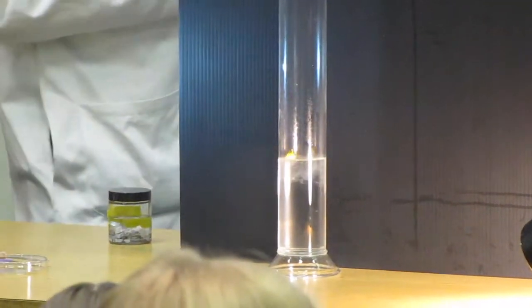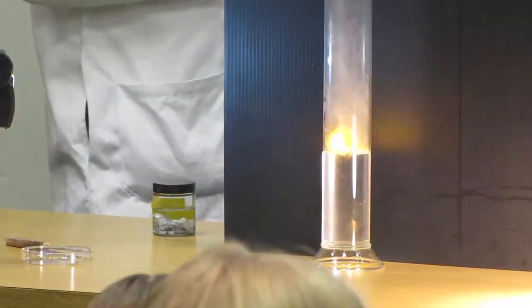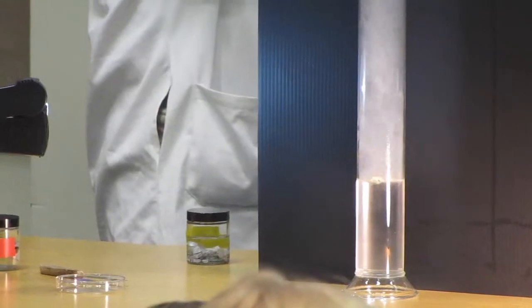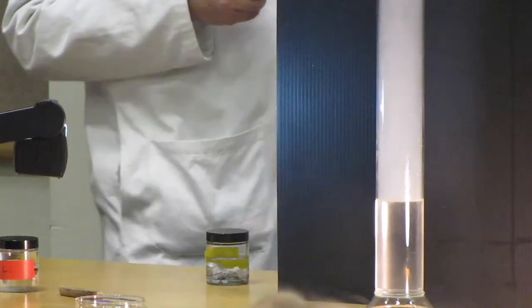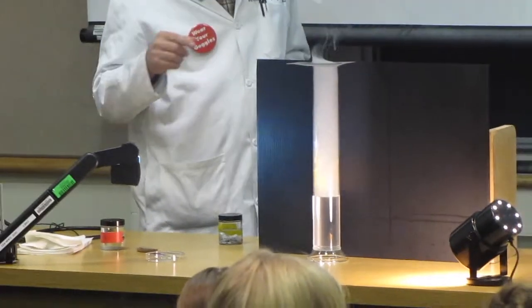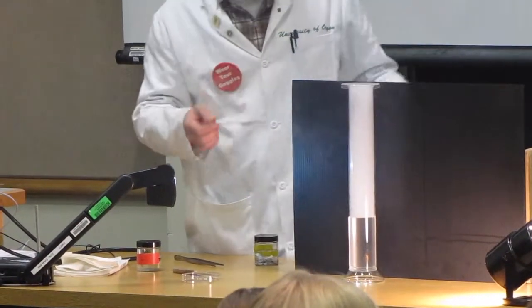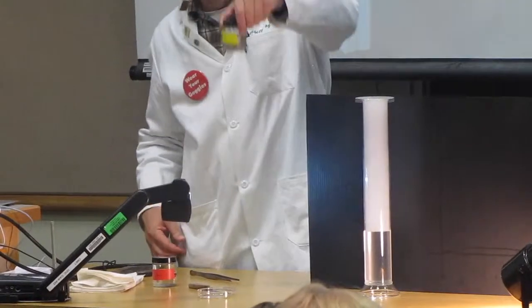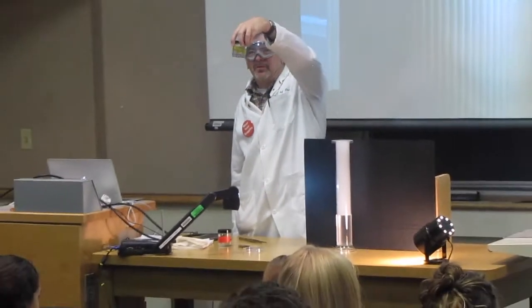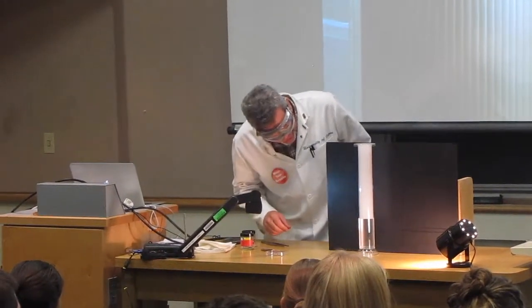It immediately melts. Oh, the flame! Don't breathe that stuff. Is this more dense or less dense than water? Less dense than water. More dense or less dense than mineral oil? More dense or less dense than lithium? Yeah, okay, good.